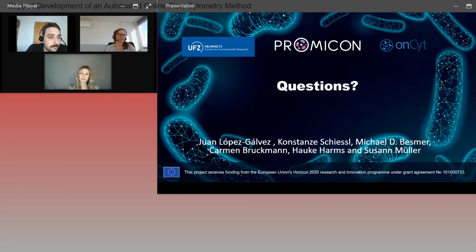Yeah, that's super cool. And then you know that because you grow them separately, or do you use other molecular techniques? No, this was also done with DAPI staining, and they are not grown individually. These are communities that we collected from wastewater treatment plants.